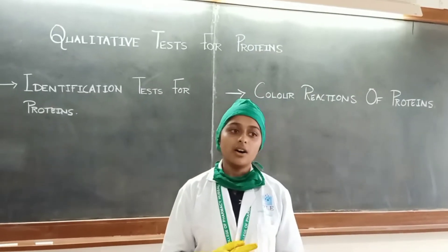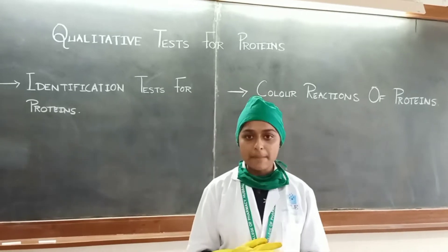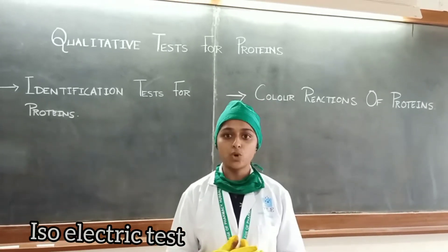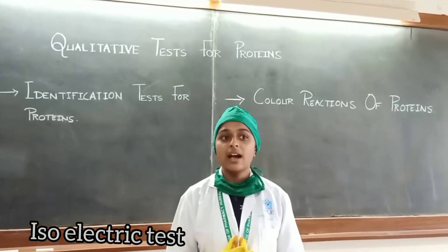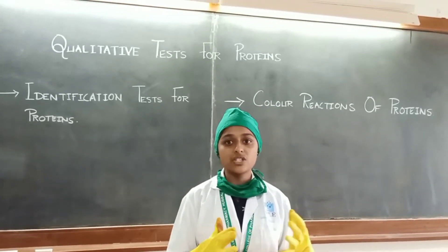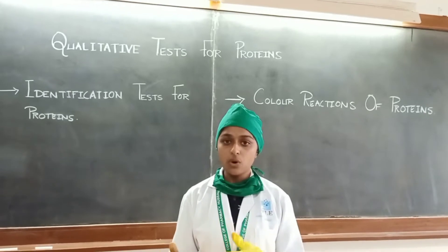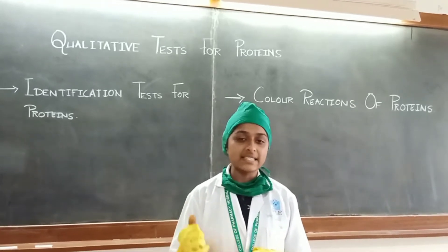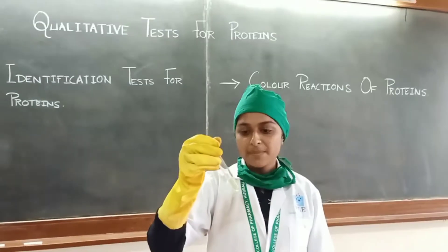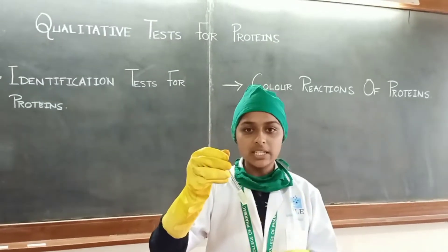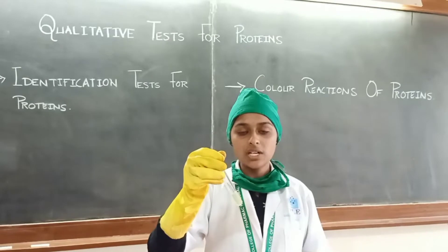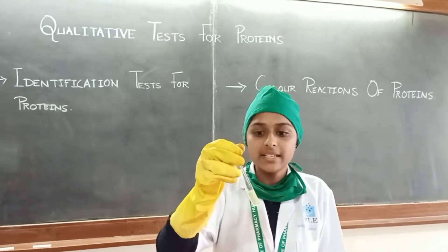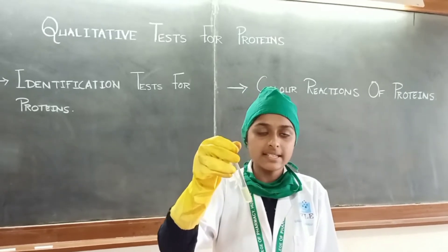Isoelectric precipitation test: 5 ml of sample plus 3 drops of bromocresol — the color changes from green to blue. Add warm concentrated acetic acid drop wise. By observing it, no curdy precipitate is observed, indicating that casein is absent.